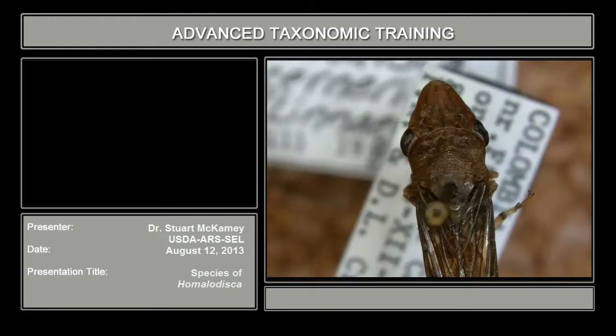To distinguish these clearly, you need to look at the genitalia. I'm going to show you the genitalia of each one and point out the diagnostic characters.